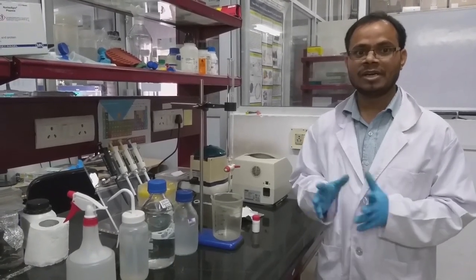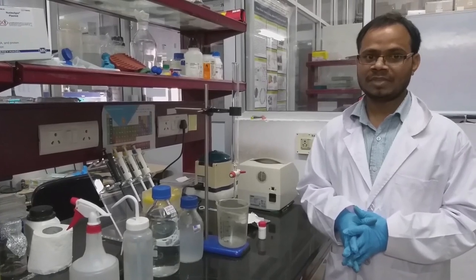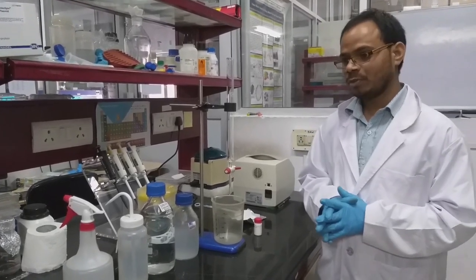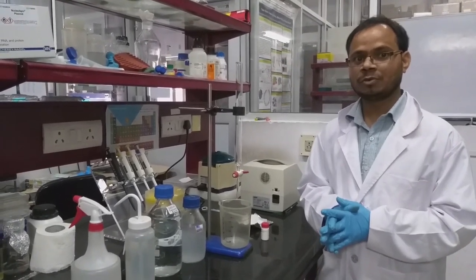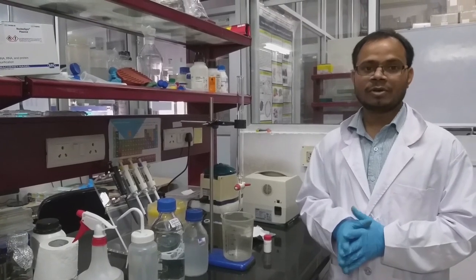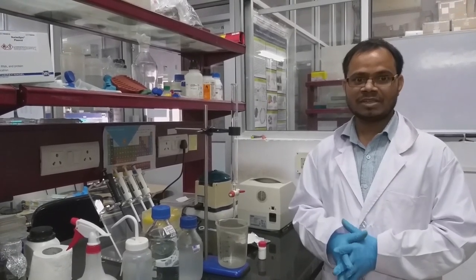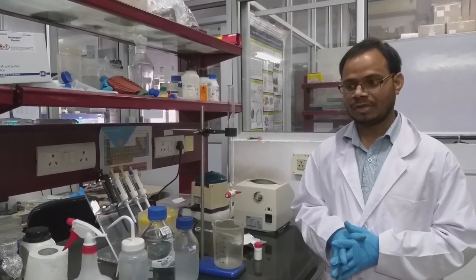Hi everyone, myself Suram Banesh, research scholar at the Department of Biosciences and Bioengineering at IIT Guwahati. In this video, we will demonstrate how to perform gel filtration chromatography or size exclusion chromatography. There are various methods available in chromatography to separate different types of biomolecules. For example, if you want to separate based on size or shape, it is called gel filtration chromatography, which suits the most. If you want to separate molecules based on their charge, then you can go for ion exchange chromatography. So various methods are available, but in this video we are mainly focusing on gel filtration or size exclusion chromatography.